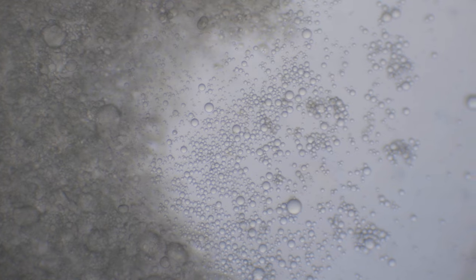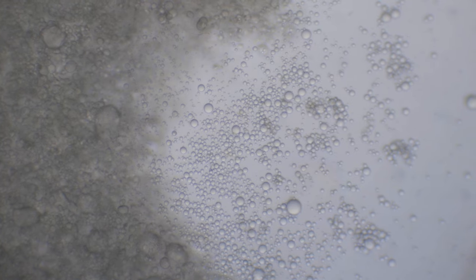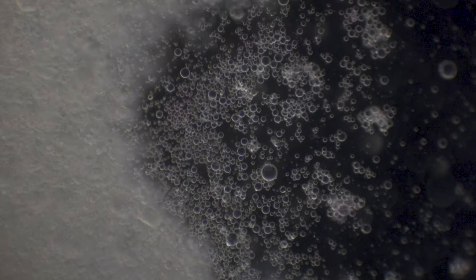These are the oil droplets that make avocados very famous. Let's switch to the darkfield condenser.